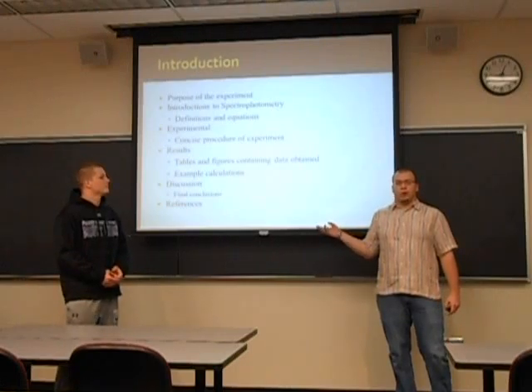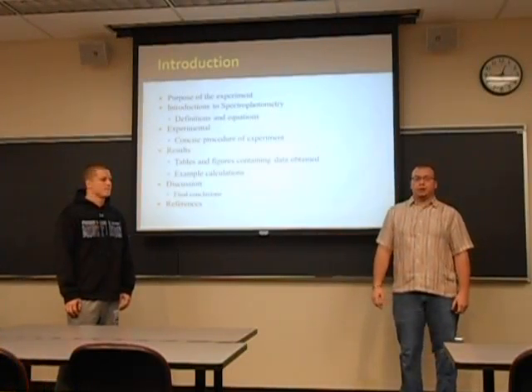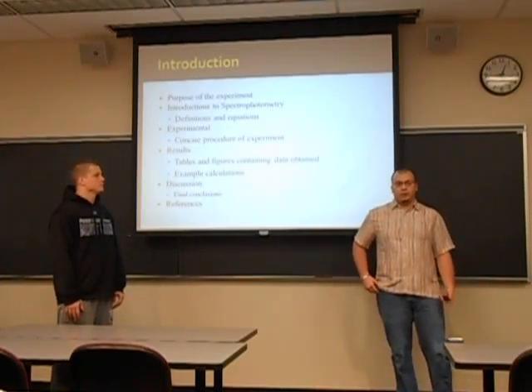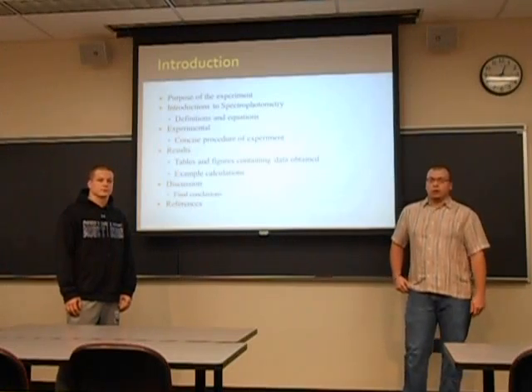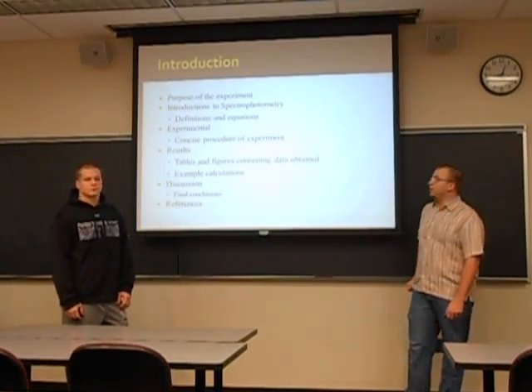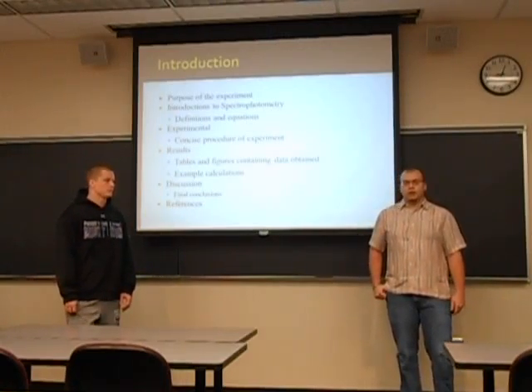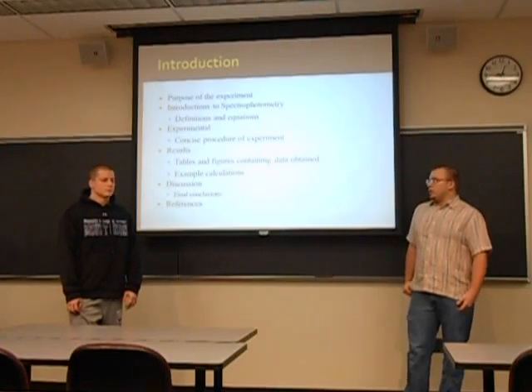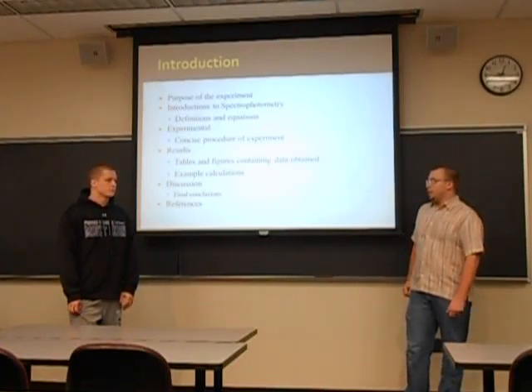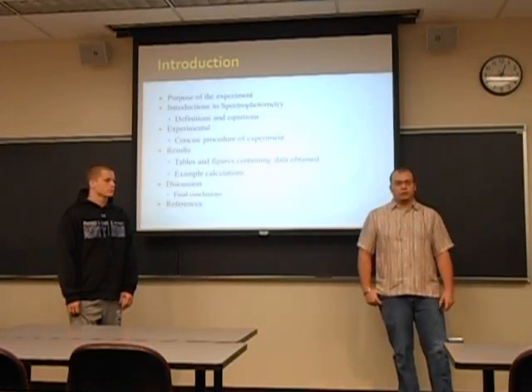We'll be going over the purpose of the presentation. We'll introduce spectrophotometry, and we'll give some definitions and equations that pertain to the experiment. We'll go over a concise summary of our experimental results. We'll go over tables and figures with some sample equations thrown in, and our final conclusions regarding the discussion section, and our references at the end.